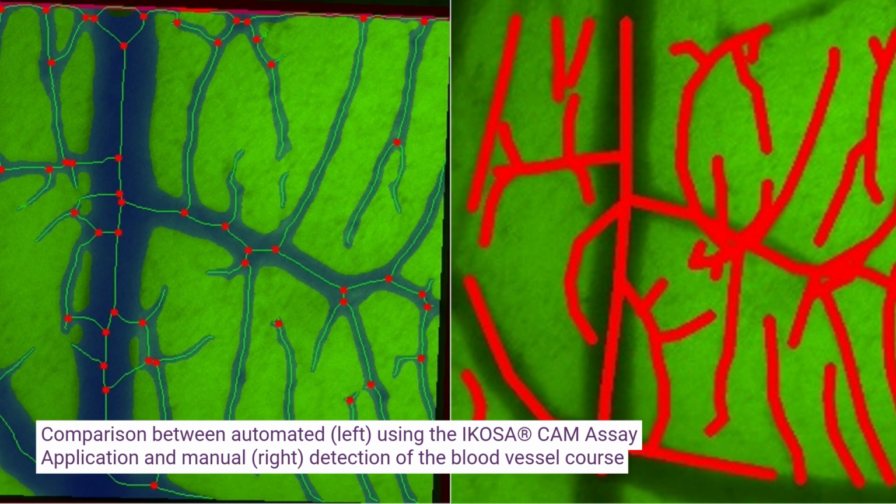So I and a lot of doctoral candidates have spent hours in the lab just trying to identify the vessels. And we found out that with AI-based systems, this is so much more time efficient, and also you exclude a lot of the bias, since you basically have no inter-rater variability anymore afterwards. I also believe the life quality of the researchers increases in this case, definitely, when you don't need to spend hours and hours in front of the computer and so forth. Okay, definitely. Understandable.